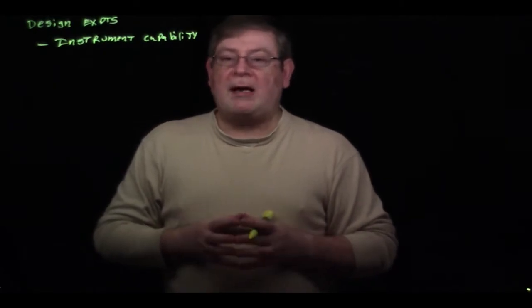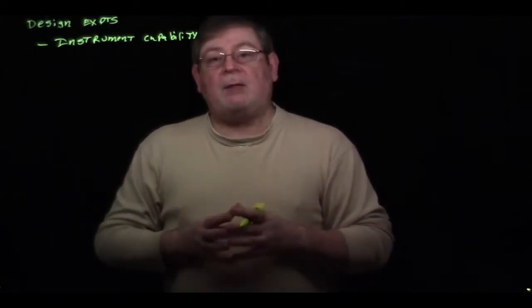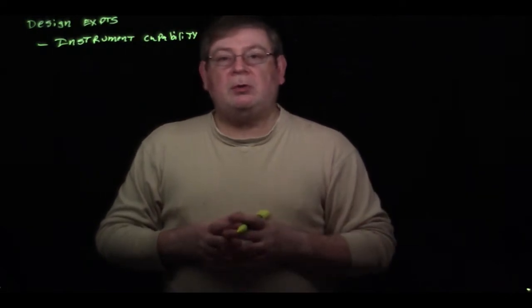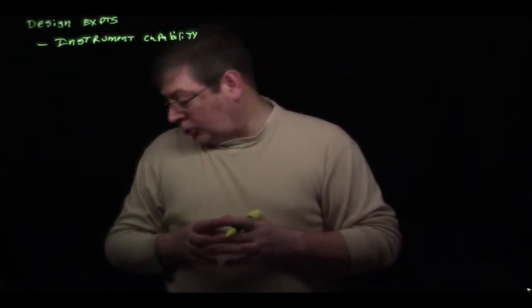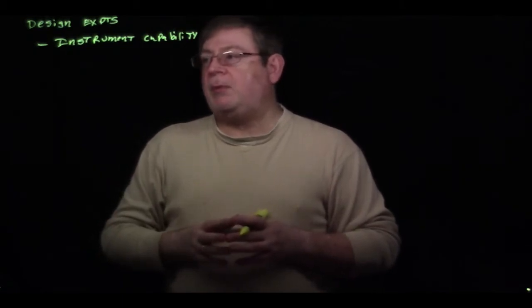MALDI has all of the right capabilities for that type of analysis. However, if you're thinking about looking at small molecules or small molecules being adducted to larger molecules, you may want to think about electrospray or APCI as your choice. So you always want to keep in mind the instrument capabilities.